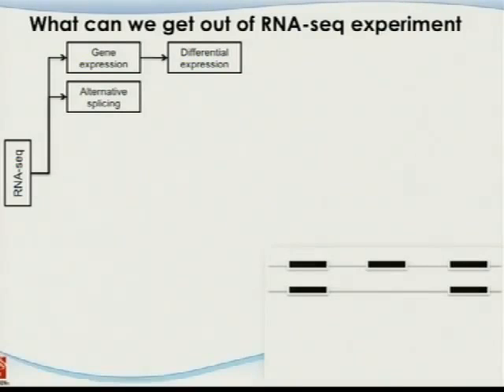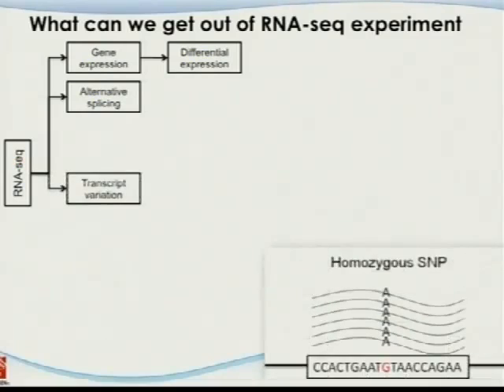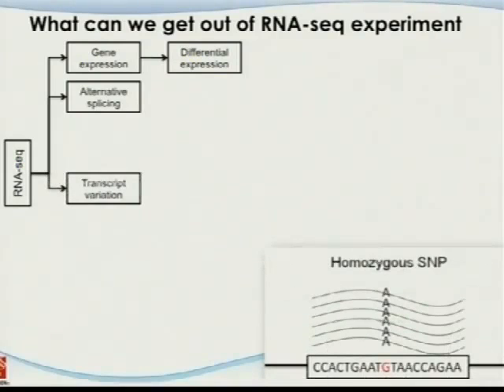So you can see that in one scenario, there are 3 exons in the final product. In the other scenario, there are only 2 exons. And if your data looks like this, you can probably guess that there are maybe 20% of this isoform plus 80% of this isoform, right? And if you are smart and devoted to look at this data. All right, things will become more complicated once the number of isoforms increases. It's impossible to do that by guessing, but there are some statistical models that can help you solve this. But the point here is you will be able to study alternative splicing using an RNA sequencing experiment.